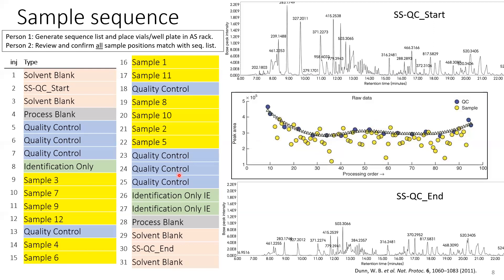We finish up with more identification-only injections of the pool QCs, maybe a process blank and a solvent blank to check for carryover, and then a system suitability test again. This is an example of a system suitability test from the beginning of the analytical sequence — a very nice chromatogram with a lot of peaks. And this is what happened at the end. So we had to clean the instruments and change the sample prep to get the same signal again, because when you compare the two chromatograms, they are completely different. We had to change parameters and restart the sequence.